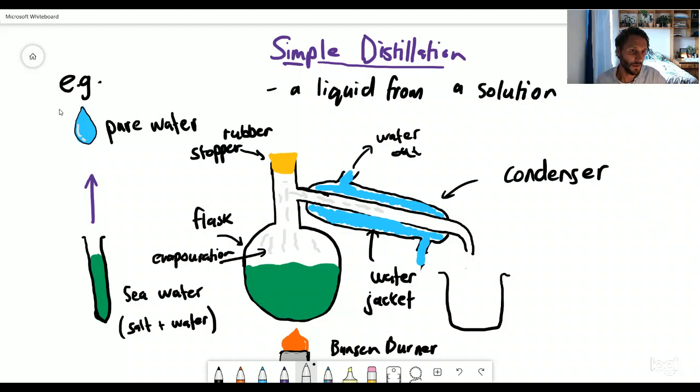And what's going to eventually happen here is, the water eventually is going to turn back into a liquid in the condenser, and it's going to drop into this beaker. Eventually, what's going to happen is, this beaker is going to fill up with pure water. That's exactly what we want. We want to separate seawater. We want to separate pure water from seawater. So eventually, what's going to collect on this side is pure water.